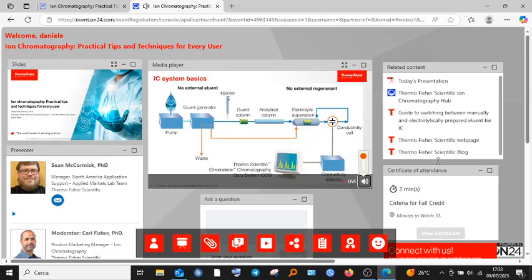Like many other liquid-based chromatography techniques, ion chromatography systems start with a pump. The pump in this case has two possible functions. In some systems, it is the provider of water to be used by the eluent generator for the automatic generation of mobile phase to a desired concentration. In other situations, it is a pump used to provide a pre-made mobile phase to the analytical flow path.